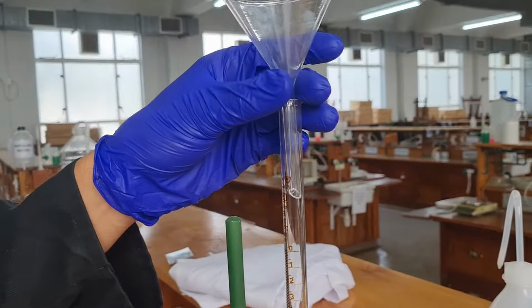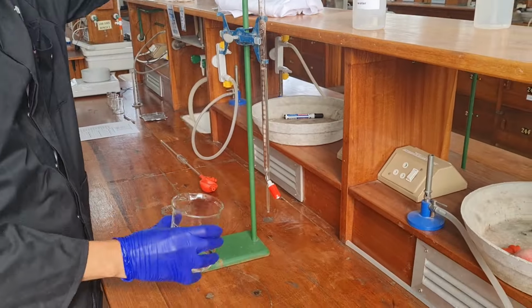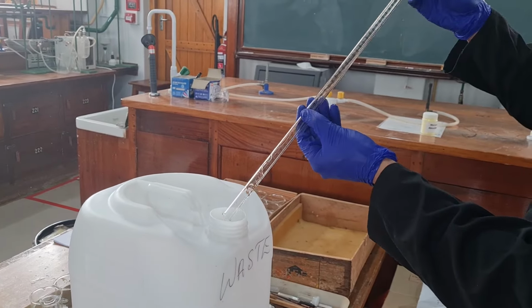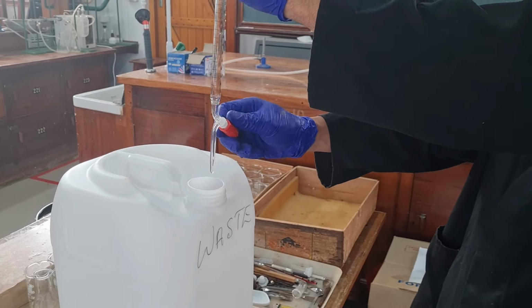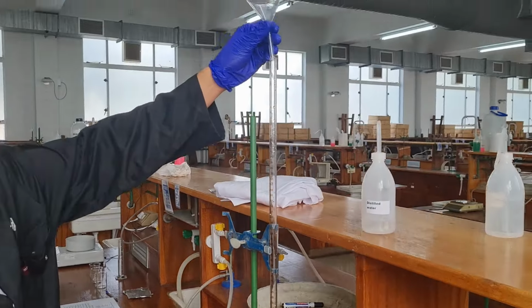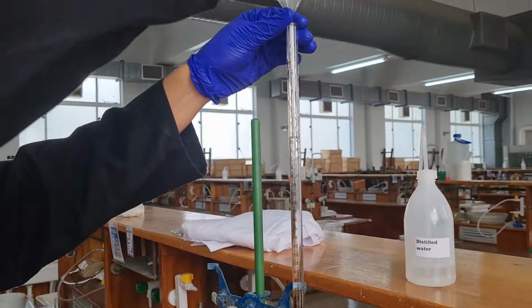Measuring with a burette. Rinse the burette as instructed and prepare the burette for use by filling it with the unknown solvent using a funnel. Remember, you don't need to fill the burette exactly up to 0.00 cubic centimeters. As long as you have determined the initial reading and a final reading, you can use the exact difference.